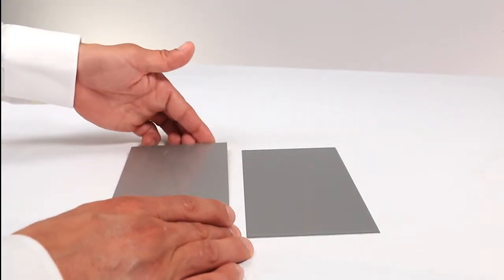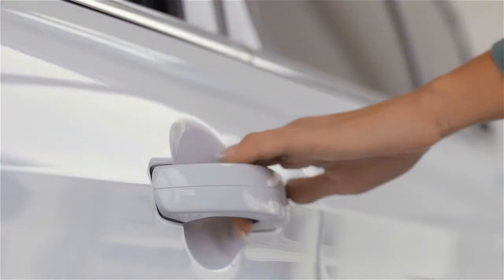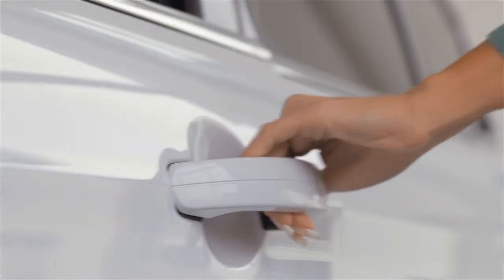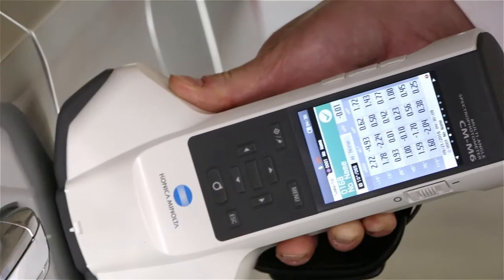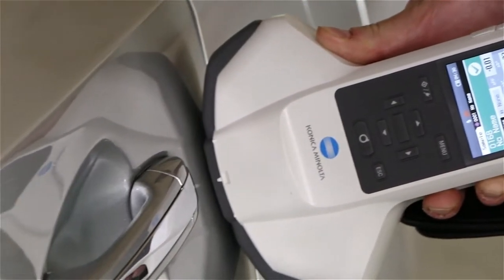Not only does a quality finish impact consumer perception, but precision color measurement saves time and waste throughout the manufacturing process.